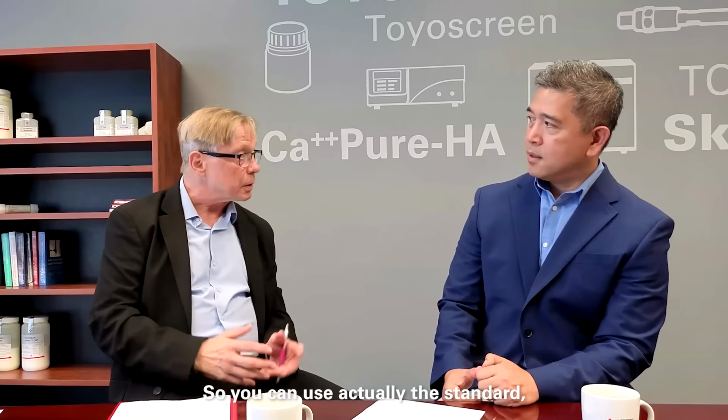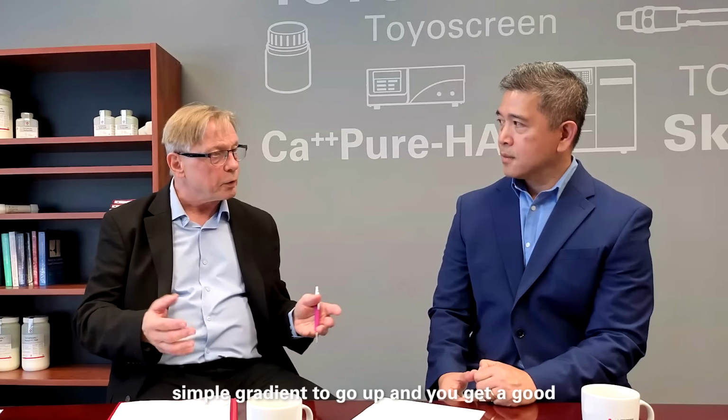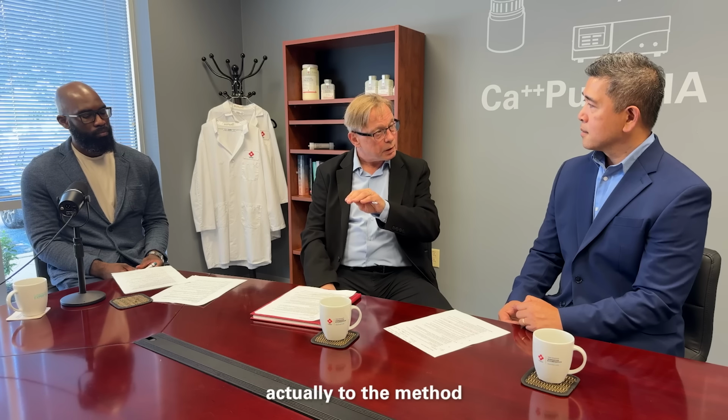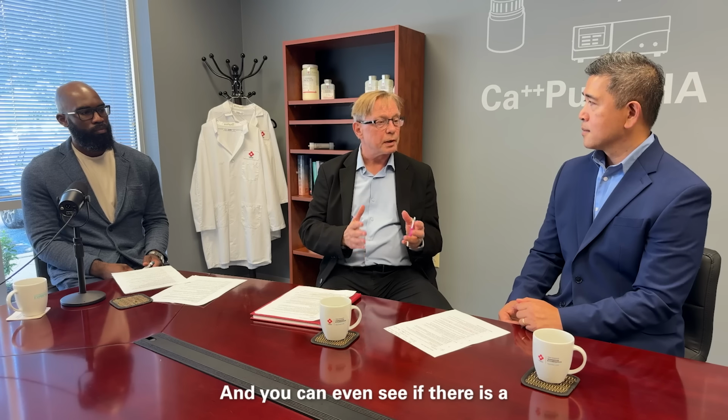You can use a standard simple gradient to go up, and you can get almost baseline separation of the empty and full capsids. But you can also add isocratic gradient steps to the method and improve it, and you can see a total separation of empties and fulls. You can even see partially packed capsids when you use the steps.